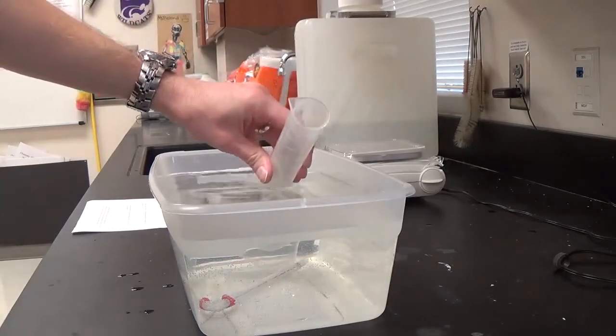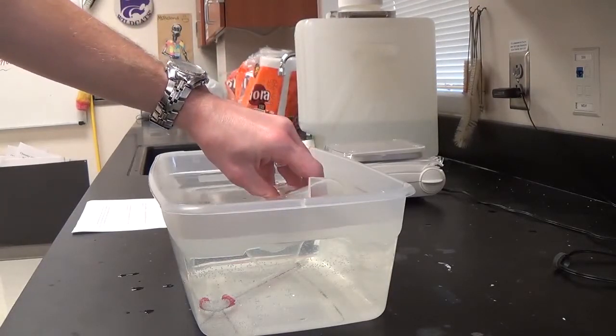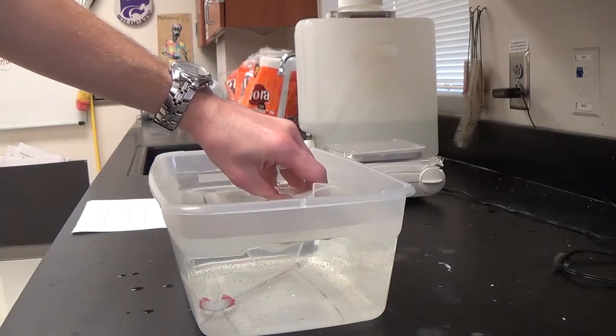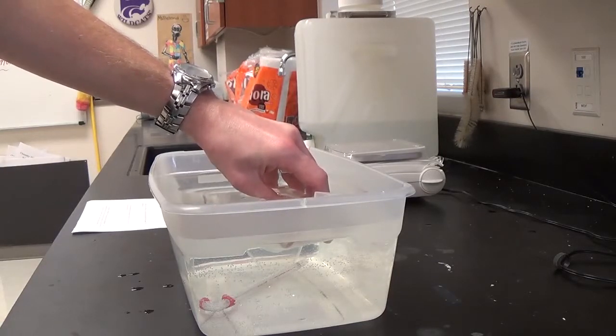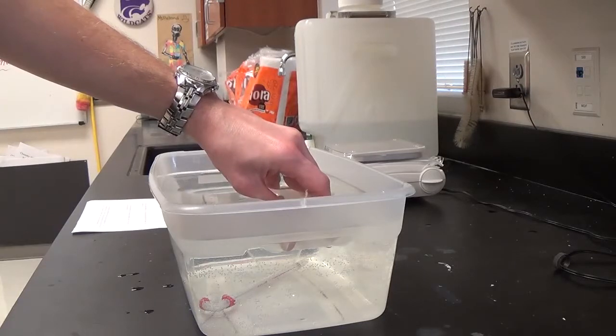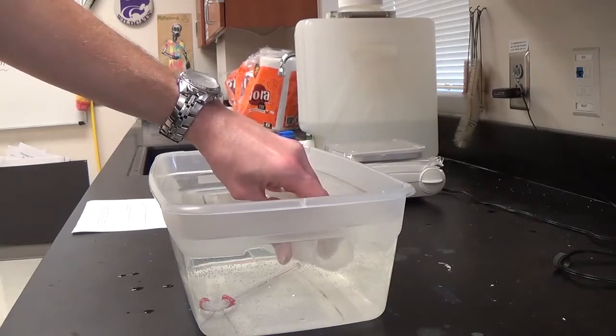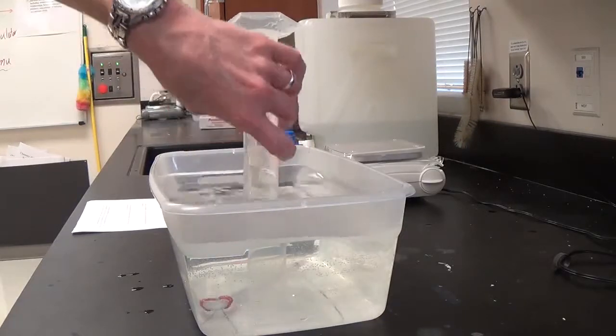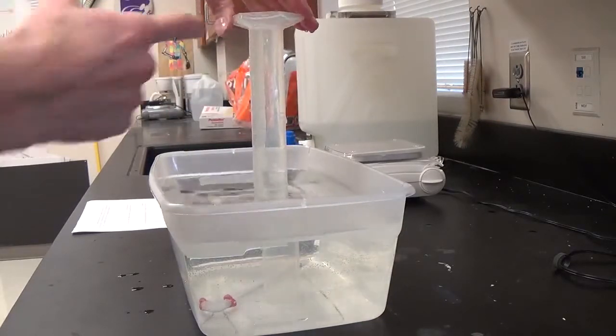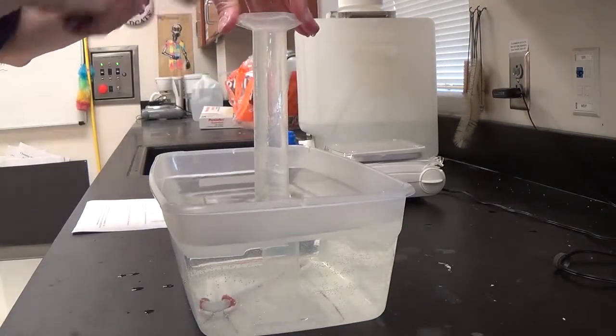Next, submerge the graduated cylinder into the water. Do it slowly and make sure that it fills with water completely so that there's no air trapped in there, because we want only butane in the graduated cylinder. Tip it up and keep the end under the water so that no air gets in, and check to make sure that there are no bubbles.